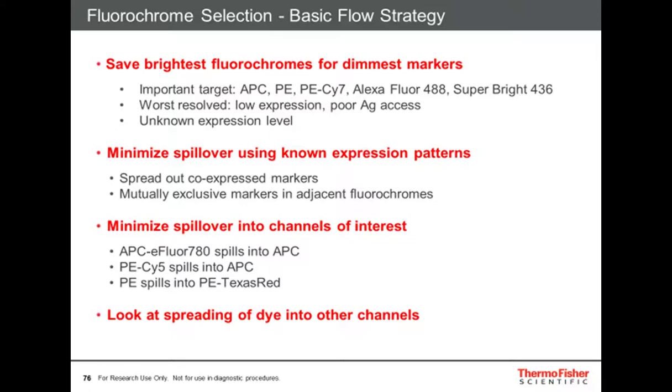So I think about this as part A and part B of panel design. I like to have a stain index chart, that's part A, and then I like to have a spillover spreading chart, that's part B. So I want to look at stain index and spillover spreading. So let's go to the stain index slide.